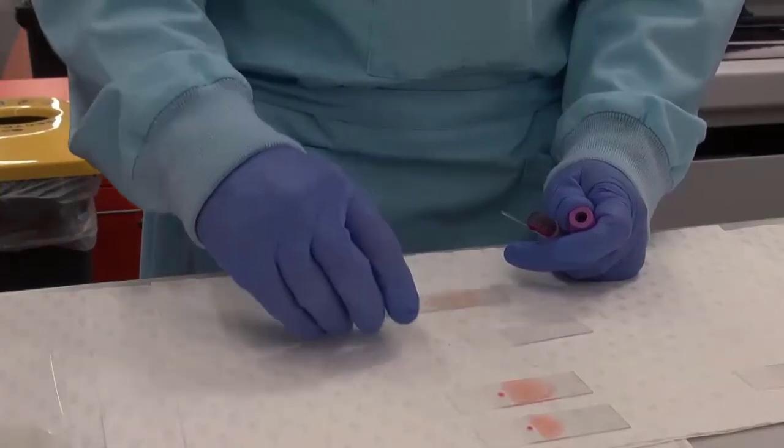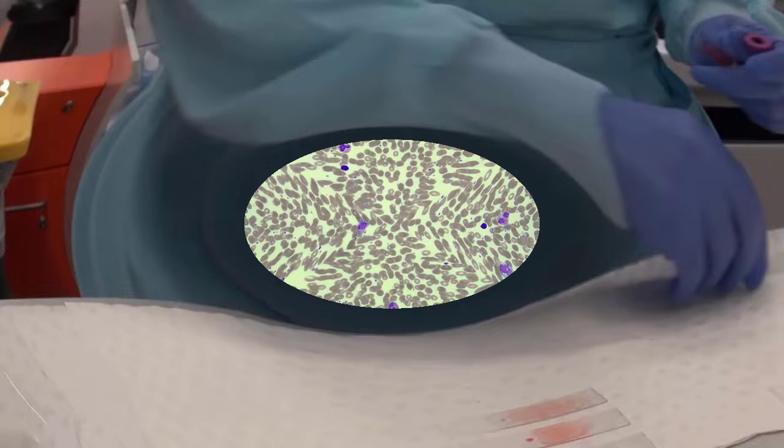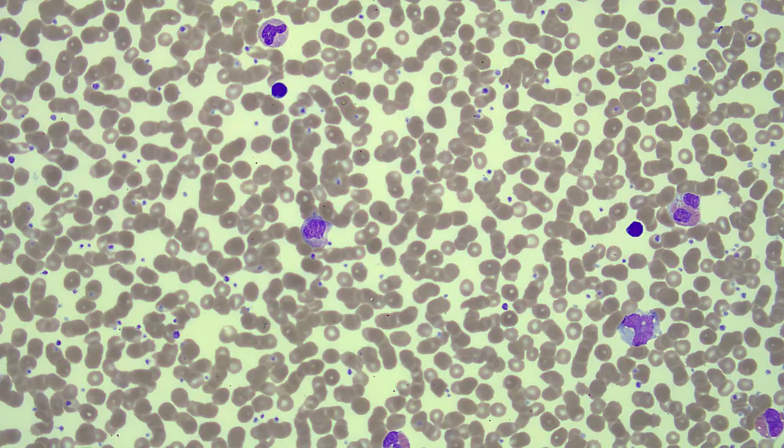There is nothing quite like a well spread slide. The problem of a short spread is that the film appears packed and there's not enough space to observe morphology properly.